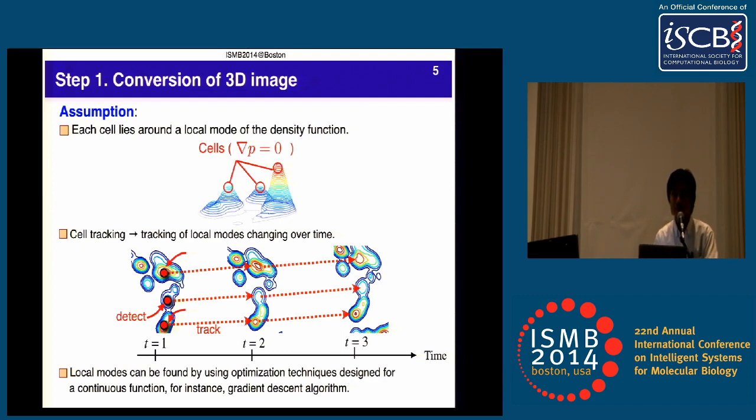A comment on that. I think you actually have to have really nice, clean, low-noise data. Otherwise, if you have some rather wider region, you might have multiple peaks for a single cell. So I think the peak assumption could hold maybe in your situation, but in others I think it is more difficult.